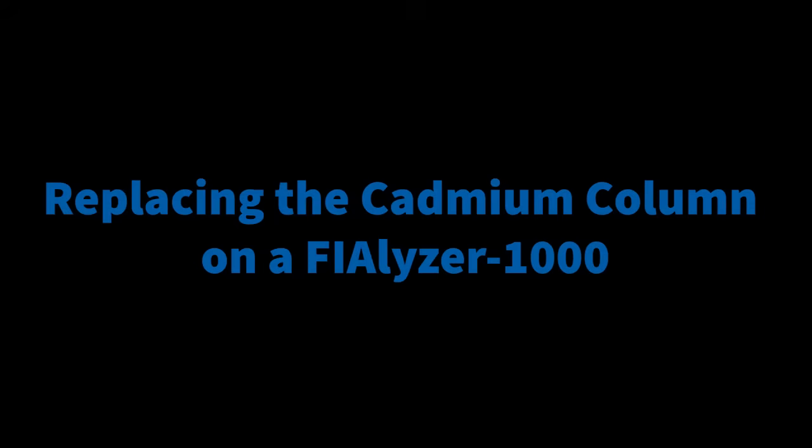Welcome to the FIAlab tutorial series. In this video, we'll cover how to replace a cadmium column on a FIAlab or Lachat instrument.